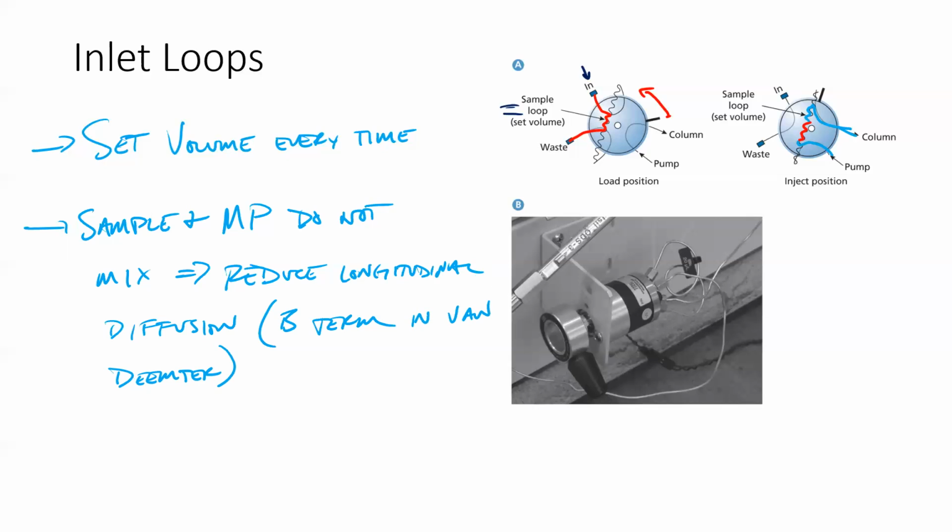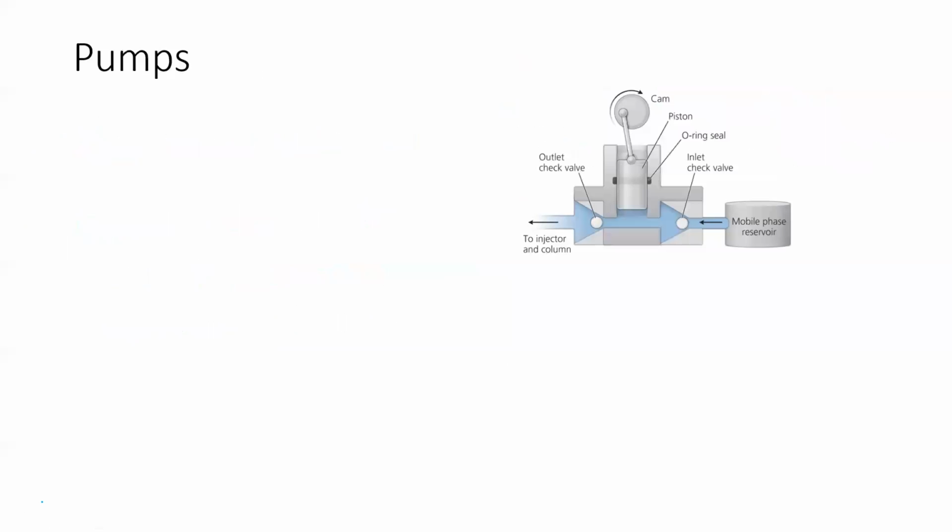All right. The last instrumentation piece for us to talk about, well, I'll talk about the pumps here a little bit. These are flow valves, check valves.